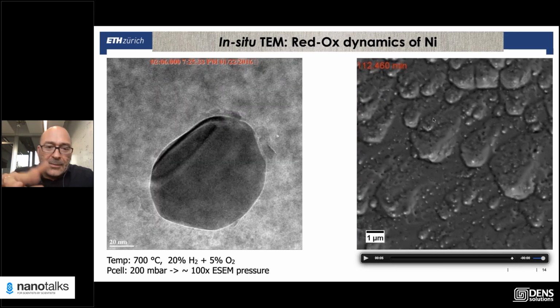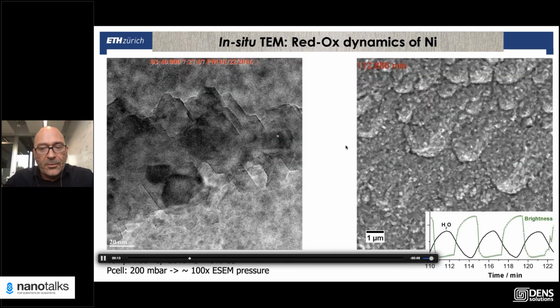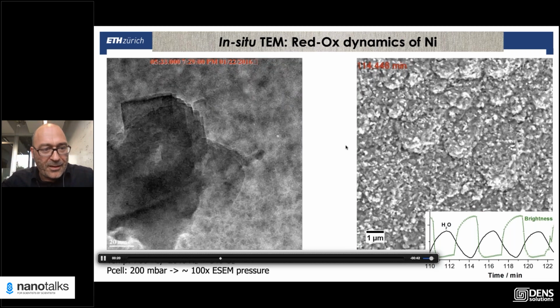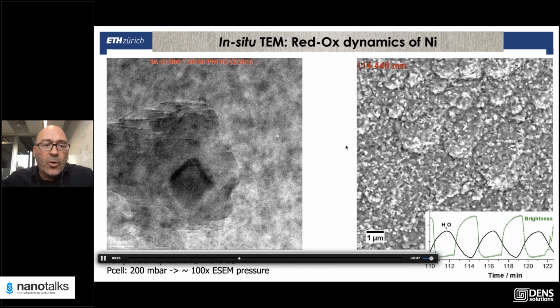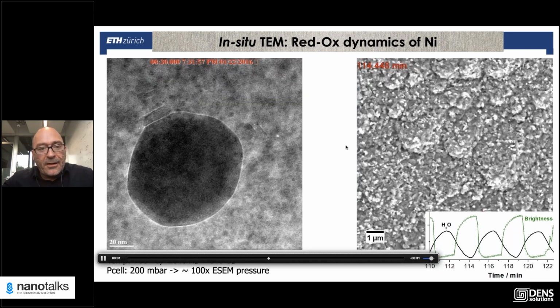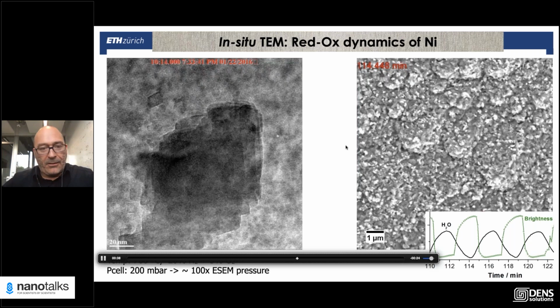But like in the SEM, after around 2 minutes of flickering around, the system falls into the oxidic state, similar to the SEM. So now it's in the inactive state. It's reconfiguring. It's not completely happy either in the oxidic state because there's hydrogen around. And after a while, the hydrogen wins over and it goes back to the metallic state, that is happening now. And the funny thing is that these oscillations happen at frequencies of about 1 oscillation per 2 minutes, more or less. And it was going on and on like this forever.